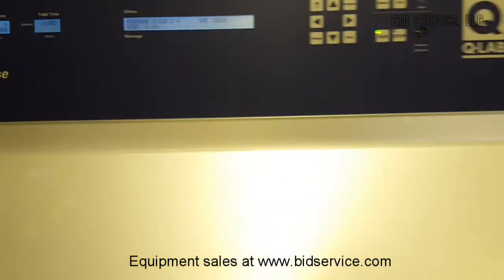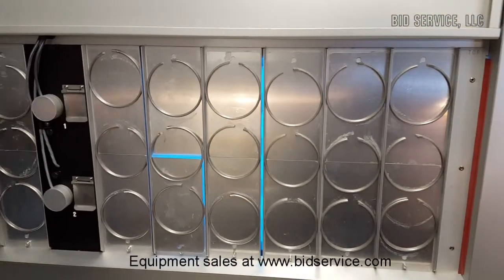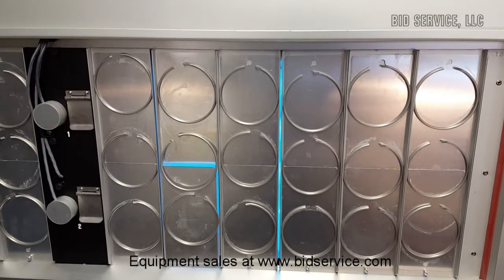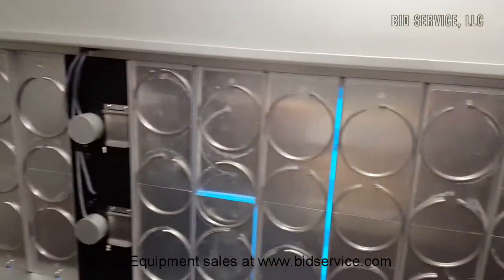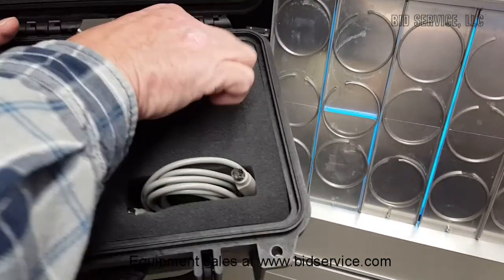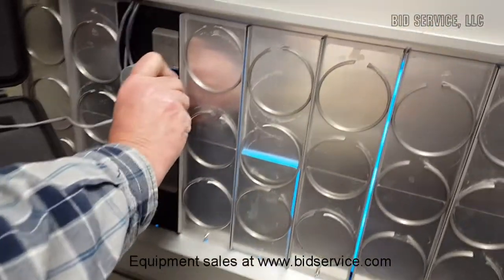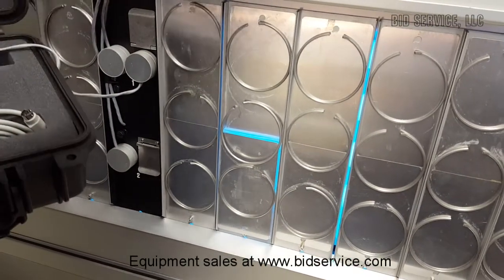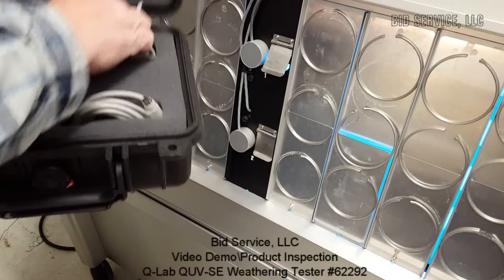If I lift up the cover here, you can see the UV light — and that's where you would hook up your calibration sensor. The unit comes with this kit. This sensor would just go in here and lock into place, and you would connect all this together and into the unit to do your calibration of your UV irradiance. This does come with the unit.